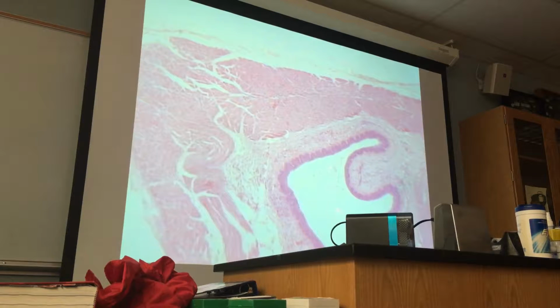And you know immediately that is the part of the GI tract where the epithelium is made of several layers of cells, stratified squamous. There are several places like pharynx, anal region, and esophagus. But in esophagus, you have a point that it does not have a serosa, it has adventitia.